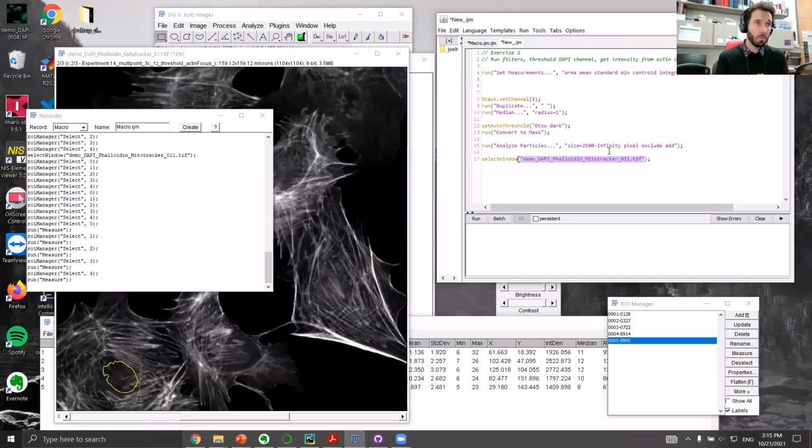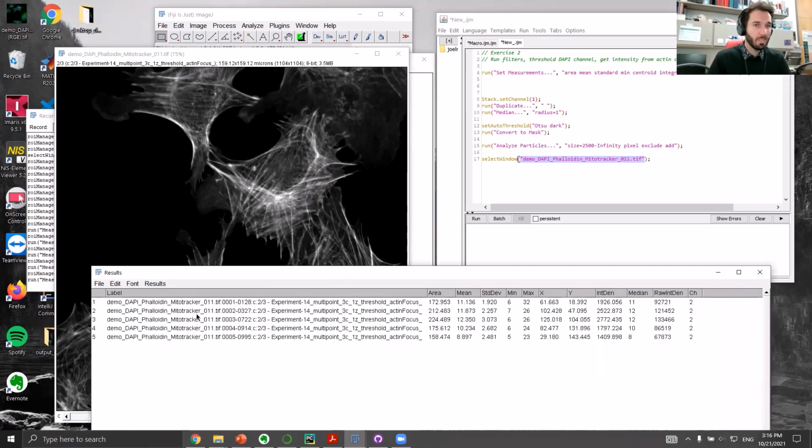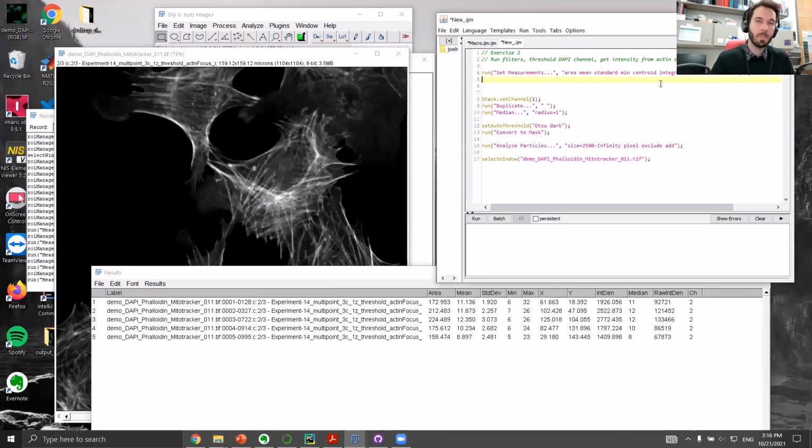And so there's multiple ways to do this. We could rename our raw image to something and always reference that. Typically, I avoid renaming things just because it's kind of nice to have the full file name to be able to use in our measurements. That way we end up with the file name, for example, in our results. And if we create a new file, it still has the same 011, which is kind of useful. So it's not usually handy to use the rename function.